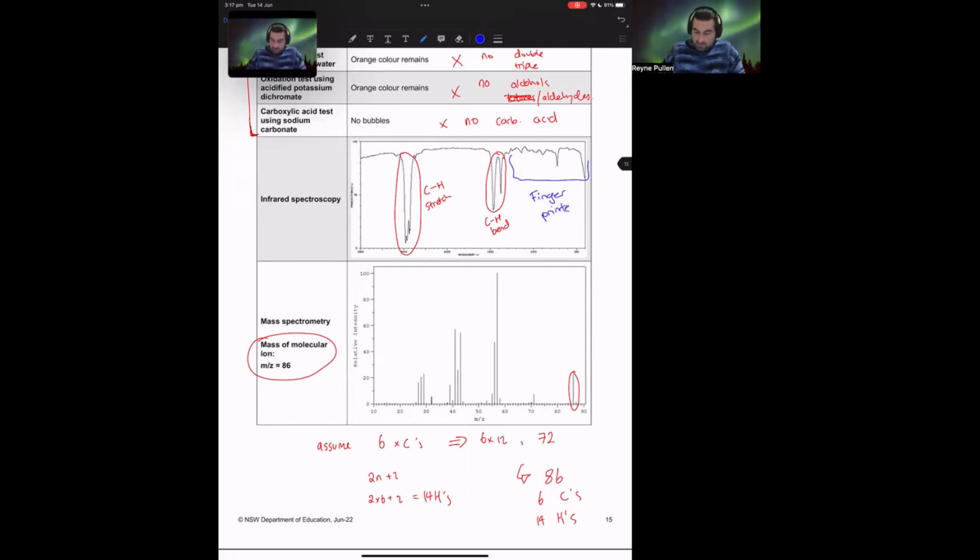Oh, no, there's no E in print. Fingerprint zone, and it's very hard to interpret anything in there because it tends to be very messy. Here it's not too bad. And occasionally you can do some really fine-tuned analysis to try and pick out something important, but as we've confirmed, there are only carbons and hydrogens, so we're happy with just picking out those two.